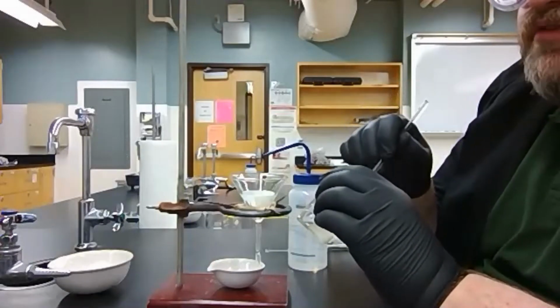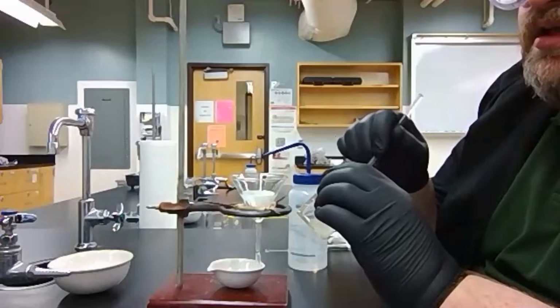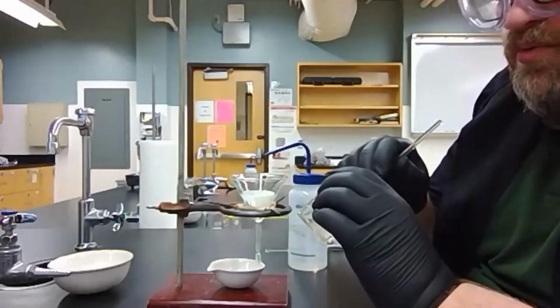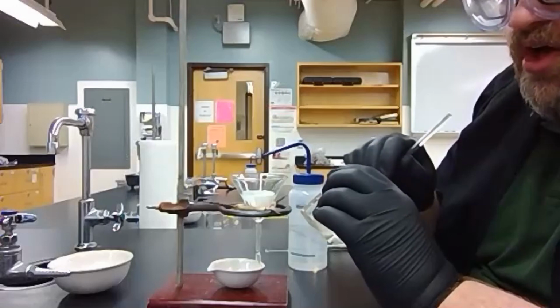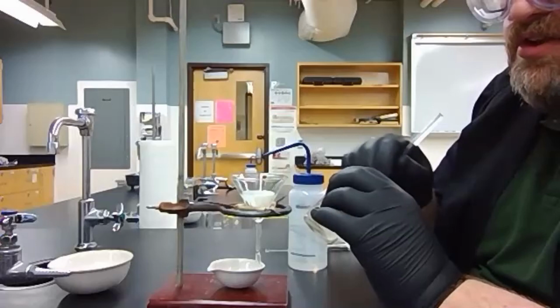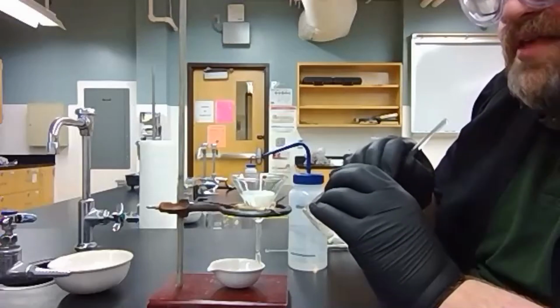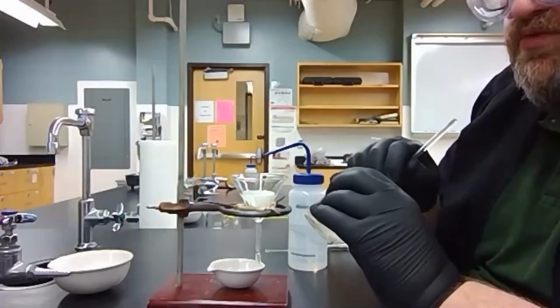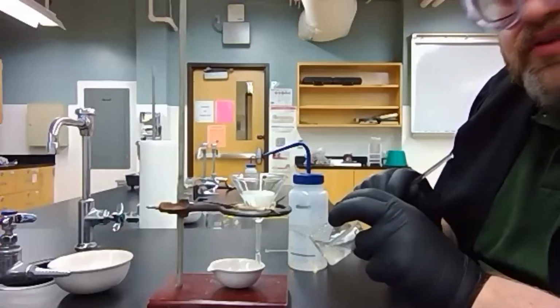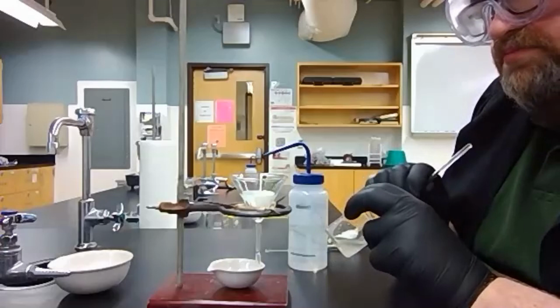And now that I think I've got enough water in here, I'm going to mix this for a good 2 minutes. We want to really make sure that we're giving that salt time to dissolve completely. Now, the reason I'm going to continue mixing it like this is that I want to be sure that the water is in full contact with the salt. So the only way to ensure that is to continuously mix it with my stir rod.